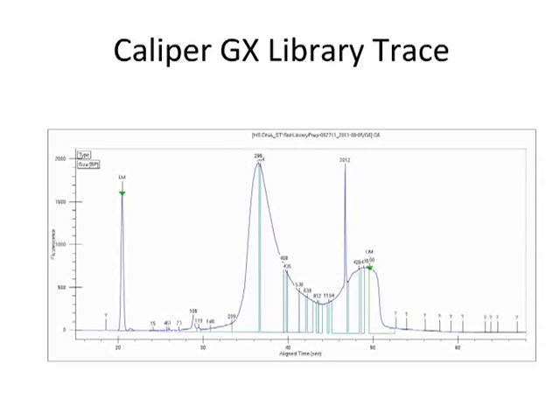You end up with a denaturation step during a PCR cycle where then there's no annealing of primer, so instead the complementary adapter ends anneal and form a bubble product that, whether it be Caliper or bioanalyzer, any of the microfluidic-based devices show this secondary peak as a size. If you were to run the same library on an agarose gel, you don't see this bubble product appear. You actually see the single library.